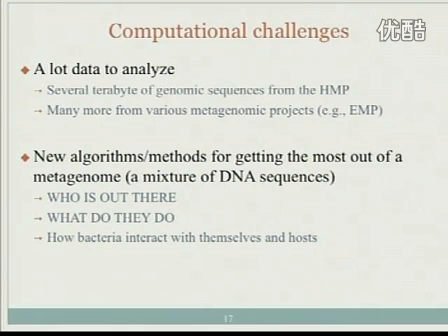And there are different analysis challenges. Once you get a lot of those 16S or shotgun reads, the first problem is that there is so much data. I have servers, but each time they always reach 100% full.